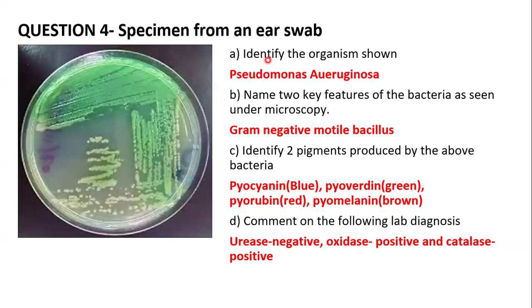If you are to use a wet mount, a drop of bacterial culture is placed on a slide and covered with a cover slip. The slide is then viewed under a microscope. Then you can see the motility. Then the specialized techniques are things like dark field microscopy. Those ones are for Treponema. That one you will see.